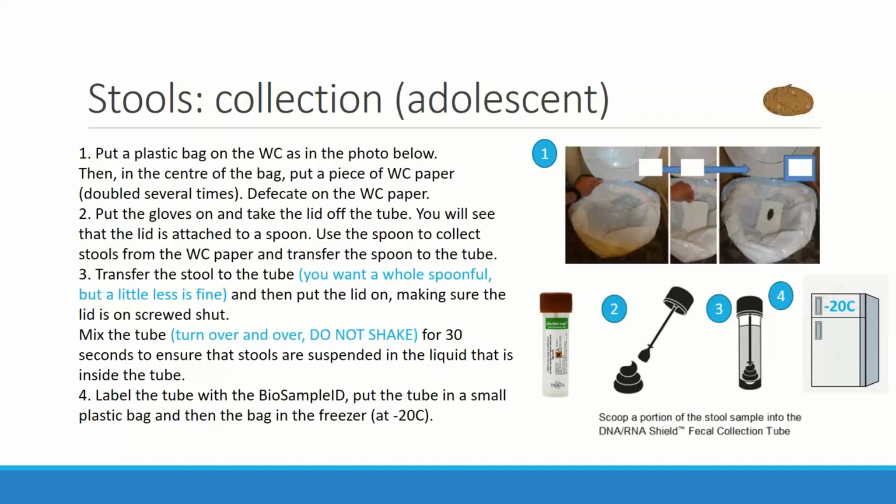Because I think we decided not to use a bin with plastic, because maybe this might introduce some problem, or I don't remember why. Maybe if we want to measure chemicals or something in the samples, but I'm not sure. So I understand that the only paper we want is the one for collecting the stools, but nothing else. What Christine is asking is if the protocol describes where to throw the paper. Okay, so maybe we can add that we need a bin on the side, because maybe it could be the same bin where everything will be thrown afterward.